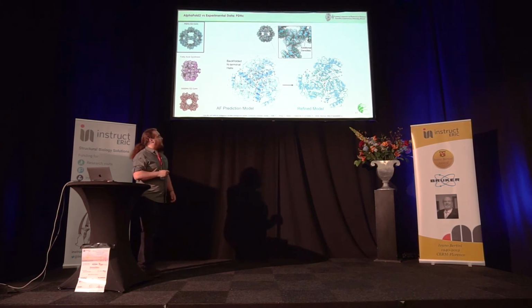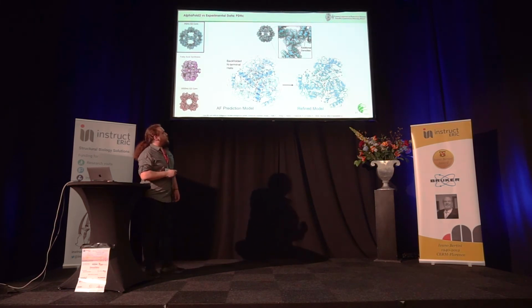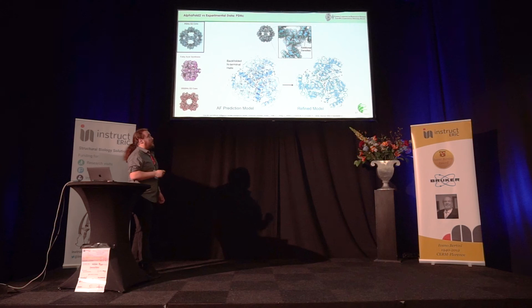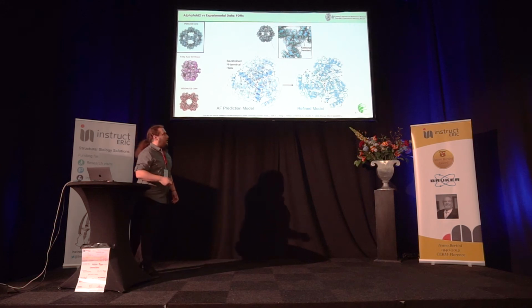From the start, even from the map itself, we could see some additional densities on the inside of the core that we could not recapitulate in a previous publication. These are interesting because they probably belong to another protein in the core, for which we already have another publication identifying these inside densities.